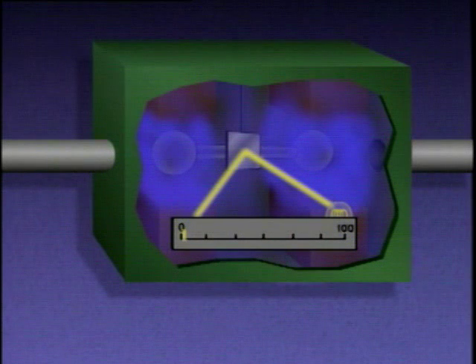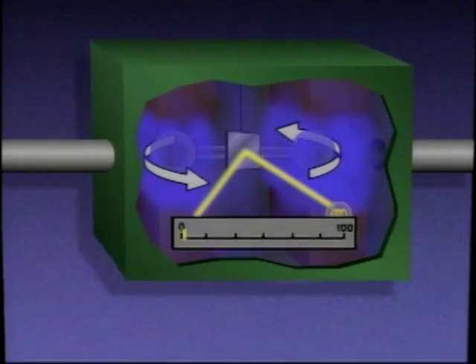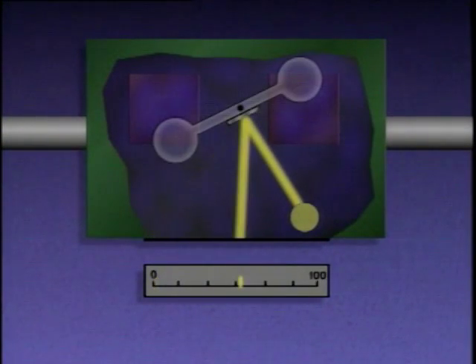During operation, the gas being measured enters through the chamber's inlet. The oxygen in the gas is attracted to the centers of the magnetic fields and tries to force the spheres of the measuring device out of the magnetic fields. Looking down from the top, we see that this causes the measuring device to turn, which changes the angle at which the light hits the mirror. The point on the scale where the light hits indicates the percent oxygen value of the gas.